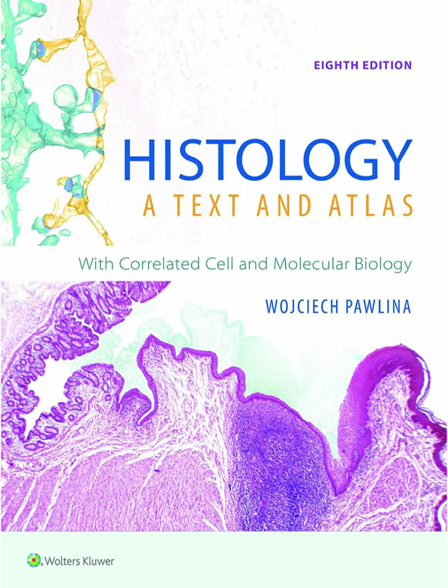Okay, super sharp optical sections. Good. And super resolution, going beyond the normal limits. Yes. Super-resolution microscopy represents a whole family of techniques designed to push past that 200-250 nanometer diffraction limit of conventional light microscopy. Breaking the rules. Kind of. They use clever tricks. For example, single-molecule localization methods like PALM or STORM involve photo-switching individual fluorescent molecules on and off, pinpointing their exact centers with much higher precision than the diffraction limit would suggest, and building up an image over time.